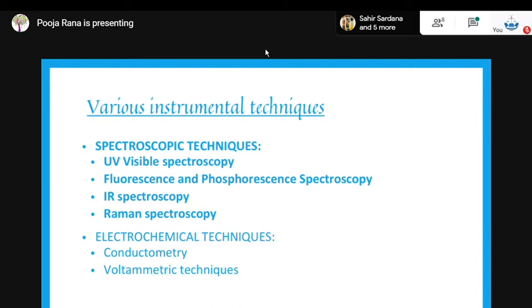All right. Now luminescence, what we generally refer to when we are flashing a particular type of light on a particular type of material, and it is reflecting back some sort of light, so that is fluorescence.